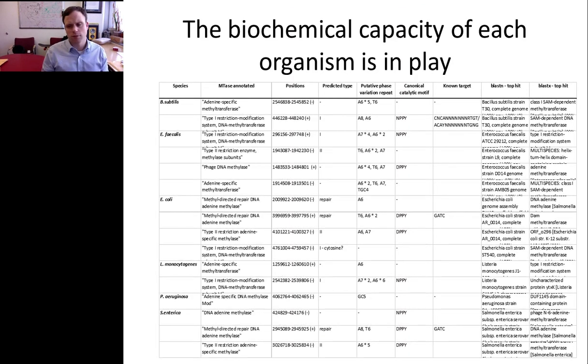So that's a bit of background on what we're thinking about for NASA, but also, again, these controls we've built, we've been mapping as part of them what methyltransferases are present in each of the Zymo strains from these controls. Again, this preprint will go online likely very soon, but we can see it's not just what they have for genes of known function, but all the biochemical capacity of what methyltransferases they have, and how that may or may not impact virulence or even adaptation to space-like environments is something we're keeping an eye on.